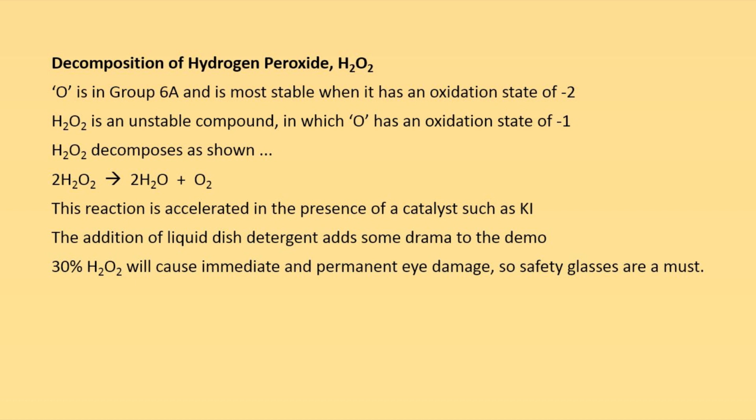Now this reaction is accelerated in the presence of potassium iodide, and the addition of some liquid dish detergent will add a little drama to the demonstration that we're about to see. Just a word of caution, 30% hydrogen peroxide will cause immediate and permanent eye damage, so safety glasses are an absolute must when doing this experiment.